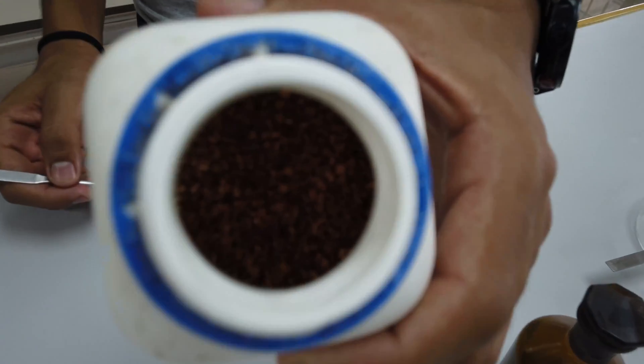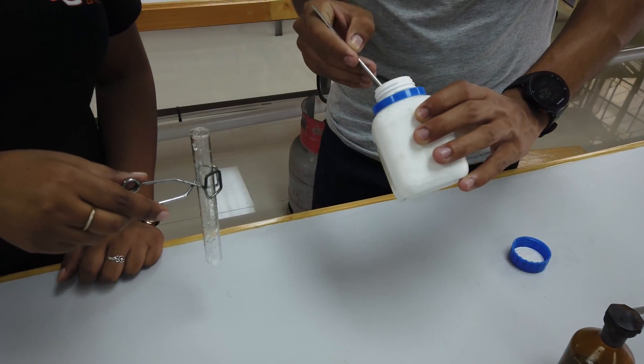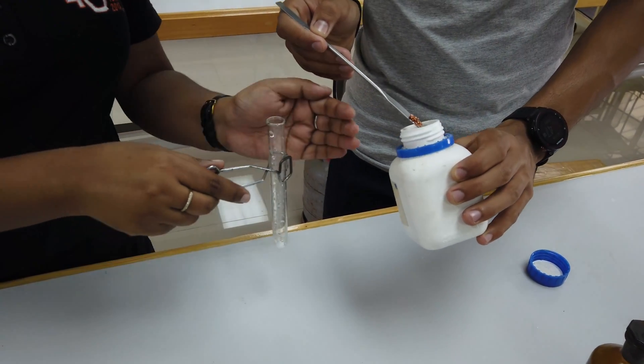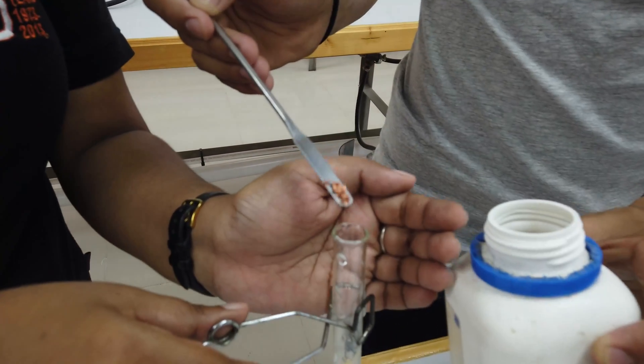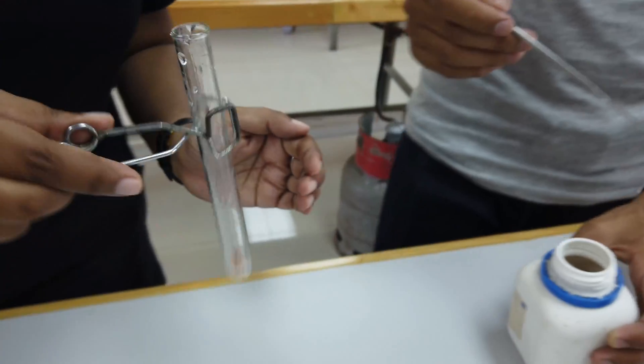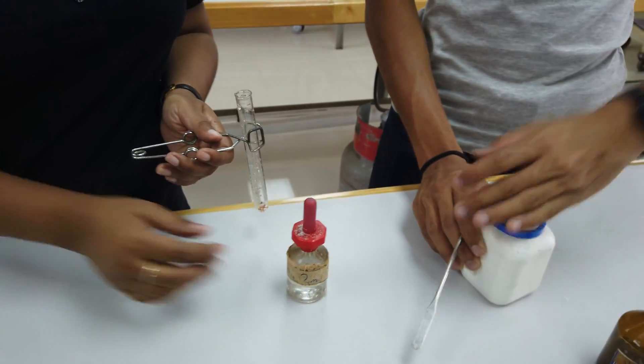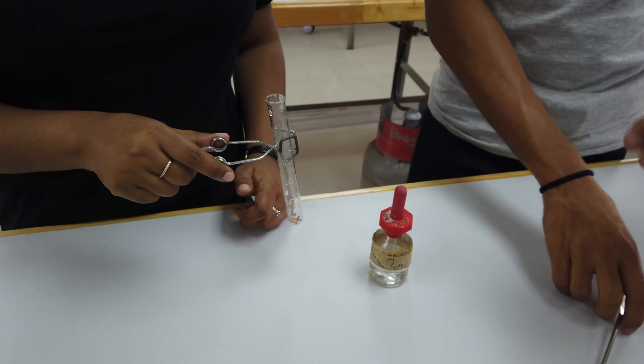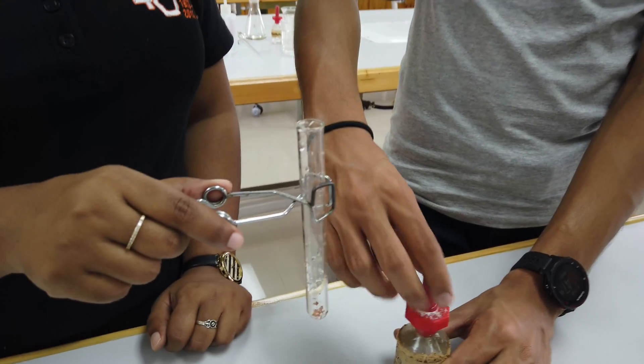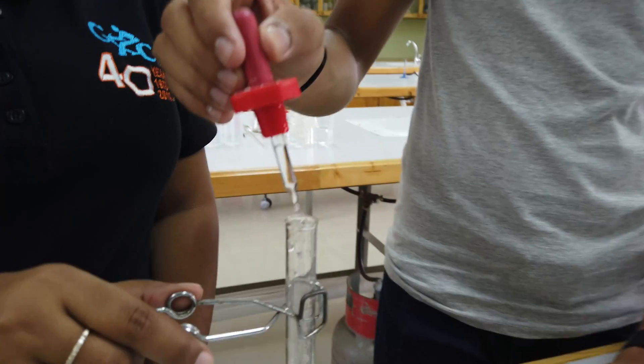We're taking just a little bit and putting it into the test tube. To this we're going to add about 10 drops of very concentrated sulfuric acid. Then we're going to heat this test tube on an open flame.